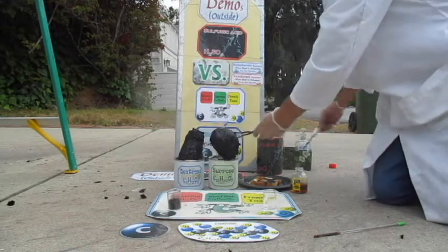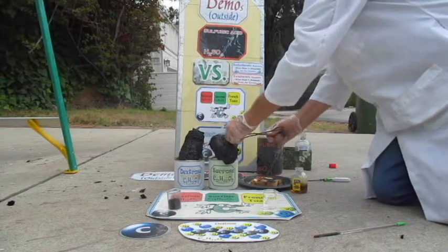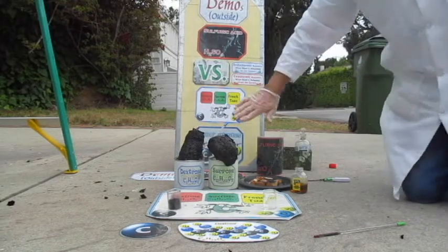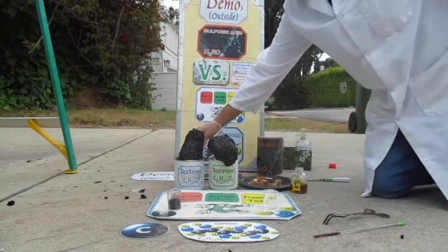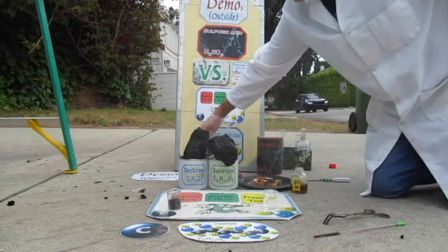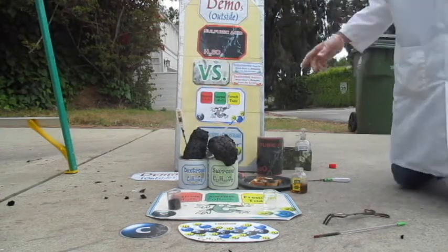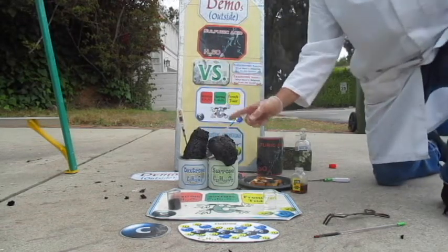I'll take this out and stick this here. Oh, there's one more I want to do. Problem is, this is hot. This is very warm, very, very hot to the touch. It feels almost as hot as boiling water. This one is hotter than boiling water. It's in the 140s Celsius, which remember, is like way over 200 degrees Fahrenheit. Okay, this is another carbon asteroid. So notice, all of that carbon came out of the carbohydrates that were in that can.